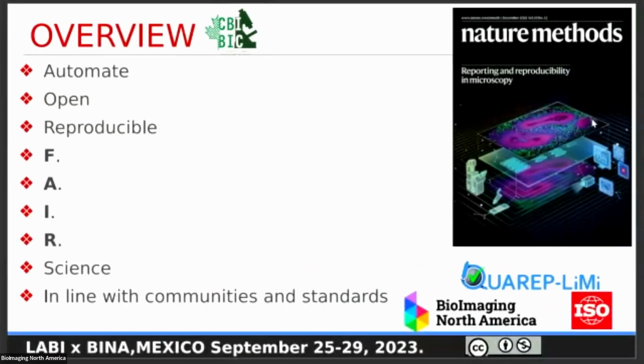We are interested in fostering automated, open, reproducible, and fair science in line with the bioimaging communities and the standard. In 2019, the ISO standard organization published the confocal ISO norm 21073. As a spin-off from this publication, an organization was created, called QUAREP-LIMI. QUAREP stands for Quality Assessment and Reproducibility for Light Microscopy Instruments and Images. QUAREP-LIMI is trying to foster the implementation and adoption of the confocal ISO norm internationally.